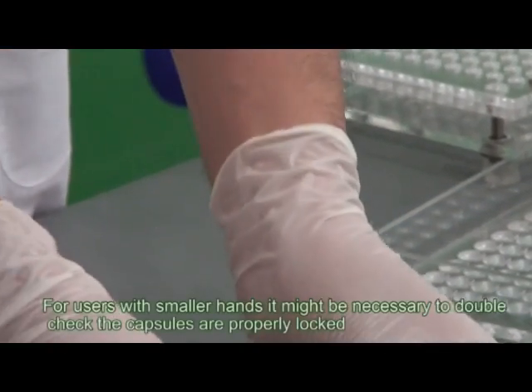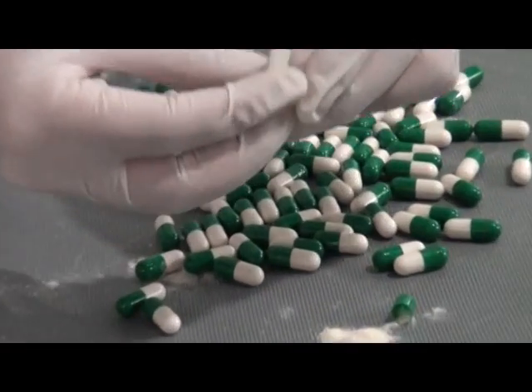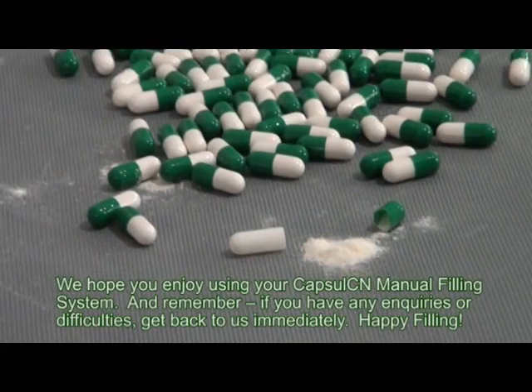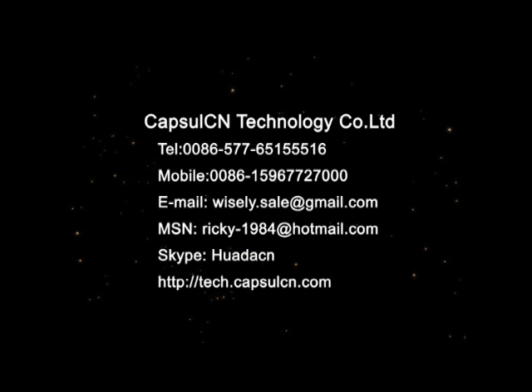For users with smaller hands, it might be necessary to double check the capsules are properly locked. We hope you enjoy using your Capsule CN manual filling system, and remember, if you have any enquiries or difficulties, get back to us immediately. Happy filling.